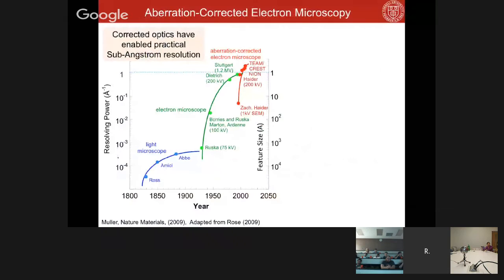Okay. So to get a little bit clearer for myself, when we use the electron, we're using the electron's wave function, and then how that wave function gets scattered, or is it the electron itself? Are we still talking about the wave part of it, which we primarily focused on? Right, right. Let me jump back to a slide I showed earlier. All right. Are we full screen right now?